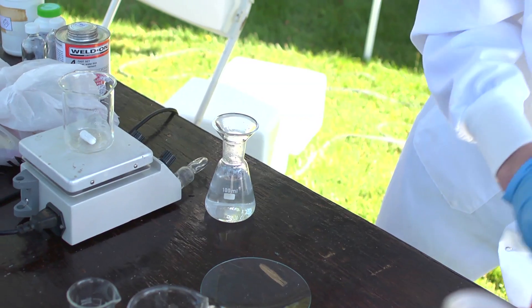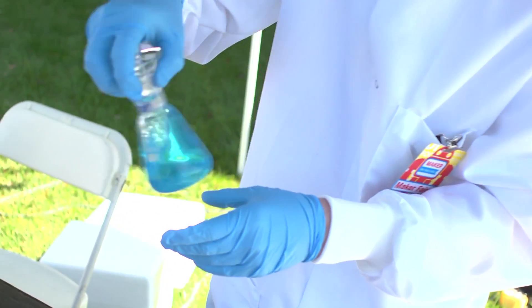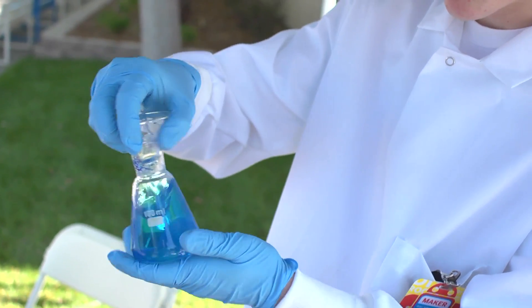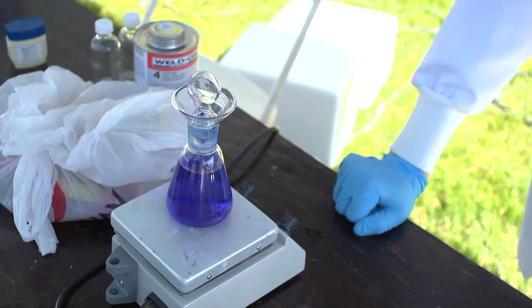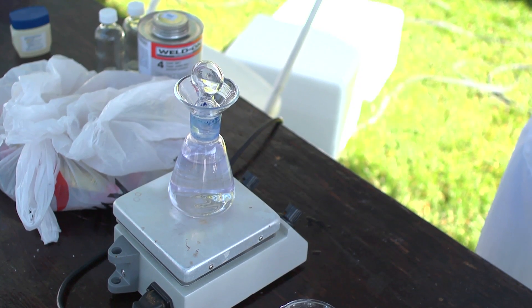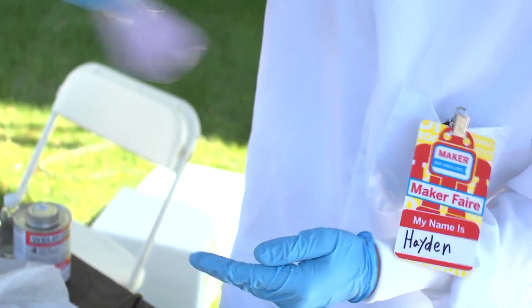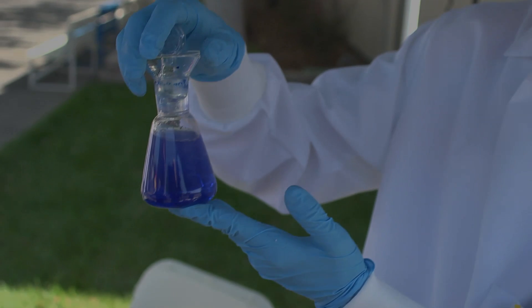If I let it sit, it'll go back to being reducing and turn clear again. Now that I've added the dye to the solution, I'm going to get it all mixed in and we'll see it go blue for a little bit. Now if I just let it sit still for a while, we'll see it go clear — there it goes. The methylene blue dye has been turned into the colorless species, and then when I shake it and make the solution oxidizing, it goes back to being blue. This can be repeated for quite a while.